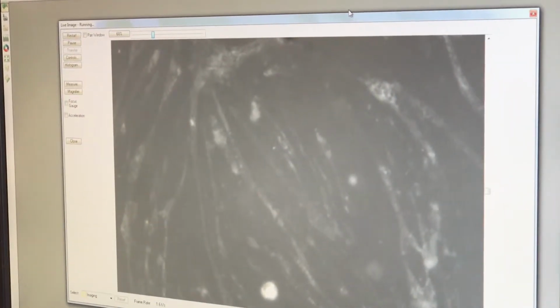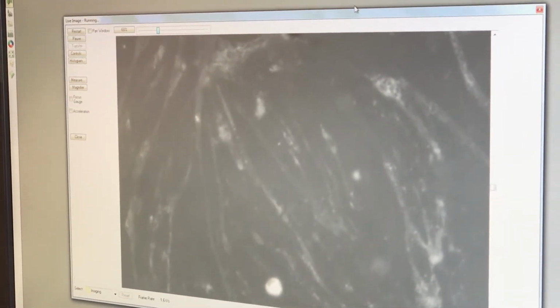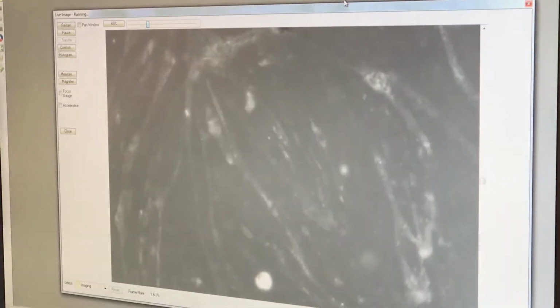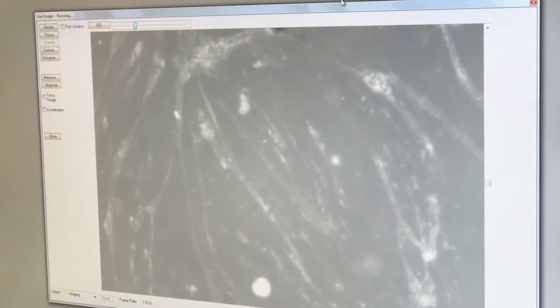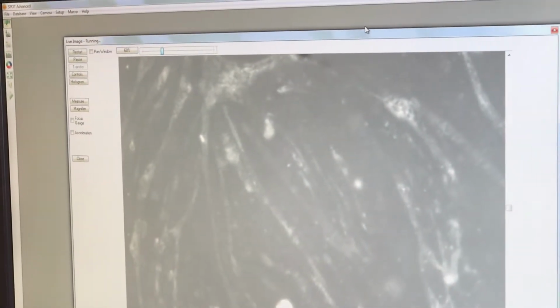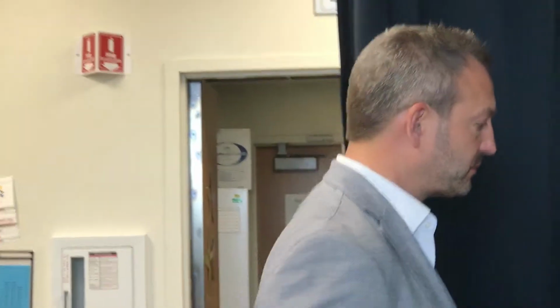We know that DUX4 is produced in the nuclei, which is a little hard to see here. Mustafa is culturing these myotubes, differentiating the myoblasts. Bruce has some RNAscope stained for different biomarkers, microRNA, and DUX4.